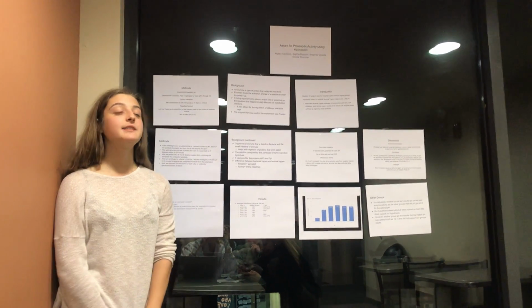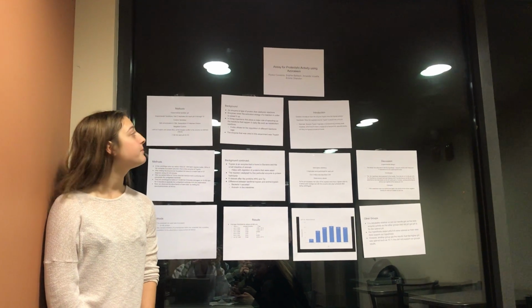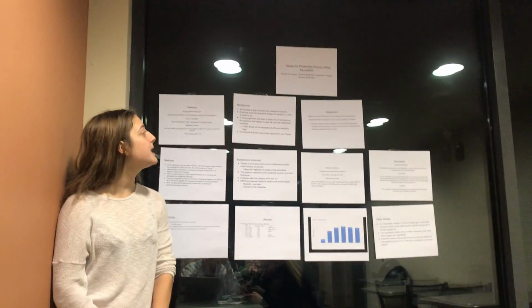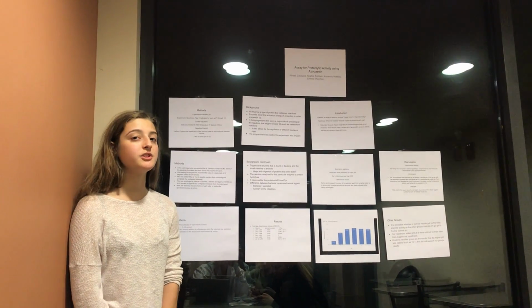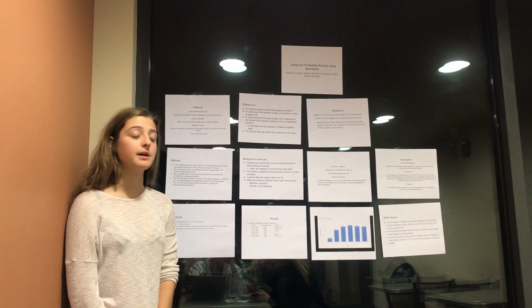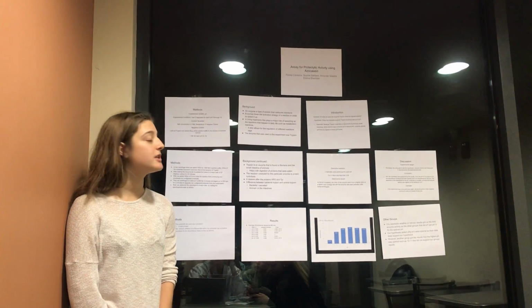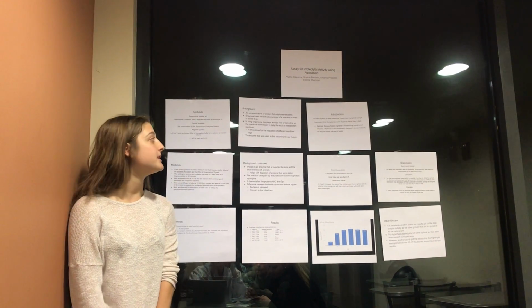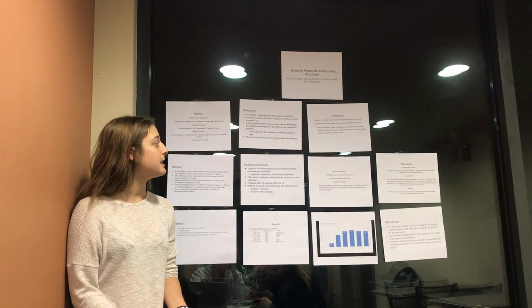My name is Alyssa Cavezza, and this is the assay for proteolytic activity using azocasein. Just for some background, an enzyme is a type of protein that catalyzes reactions. Enzymes lower the activation energy of the reaction in order to speed it up. In living organisms, this plays a major role of speeding up the reactions that happen in daily life, such as metabolism reactions. It also allows for the regulation of different reaction rates in the body.